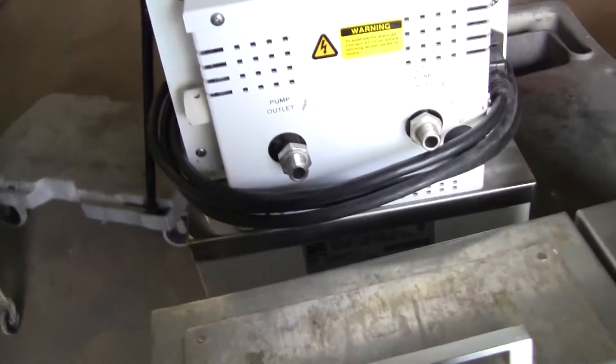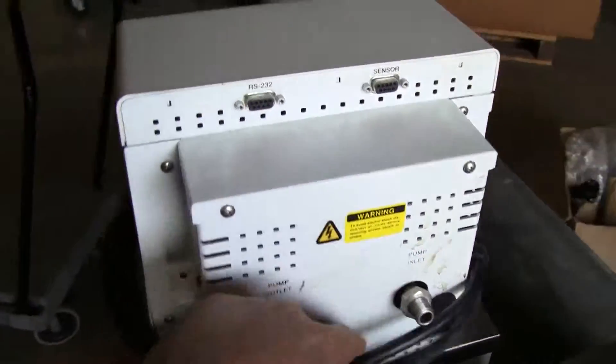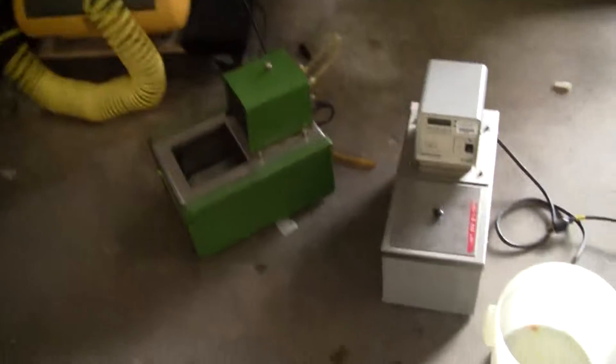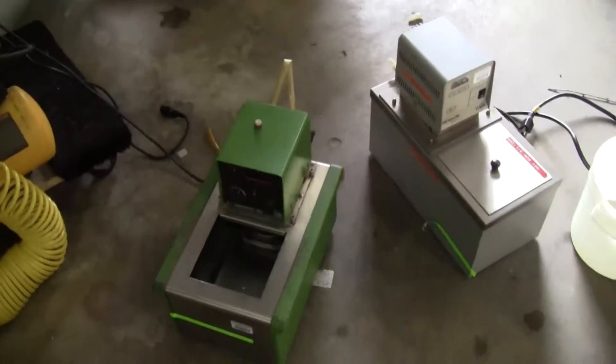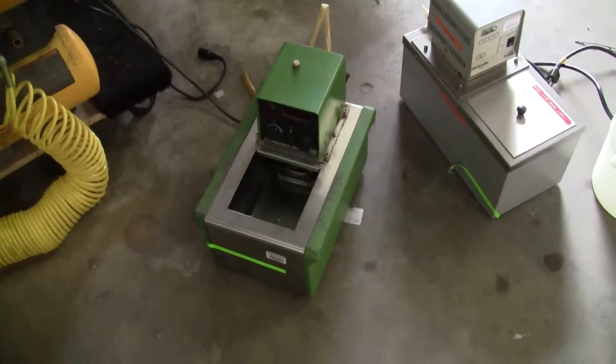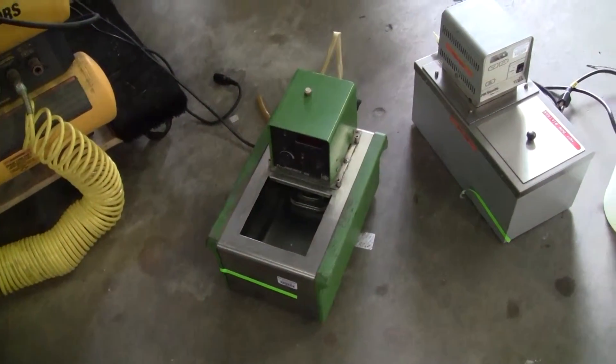This is another 7-liter Nest Lab, in and out. Heater. Lastly, we're working on the 1130s, the smaller volume 1130s — the circulators. That one actually works fine, it just doesn't look as good. We're going to clean that up next.